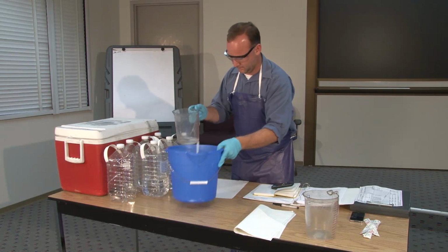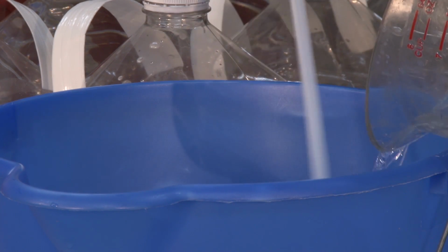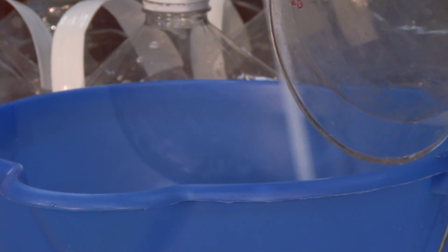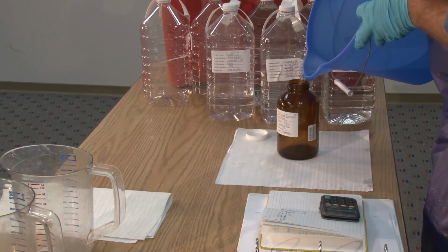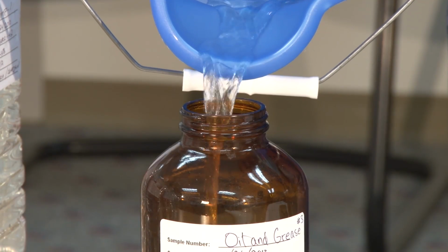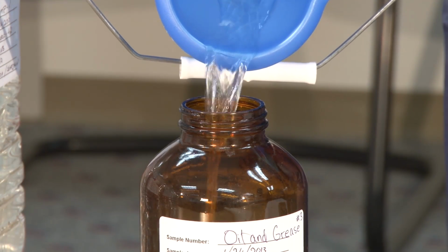Next, pour the measured volume in the graduated cylinder into the compositing collection bucket. Repeat this step for all portions to be included in the composite samples. Then use this sample to fill each of the sample containers to be sent to the lab. Do not remove solid matter. Proper handling of the samples is very important.